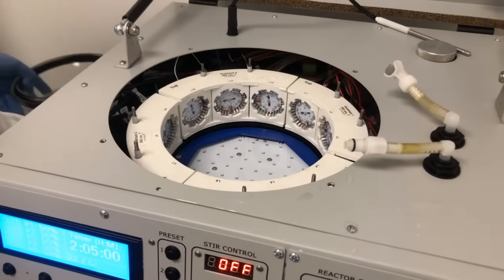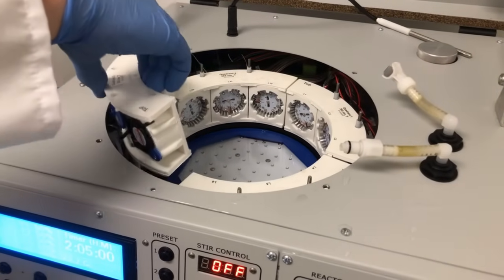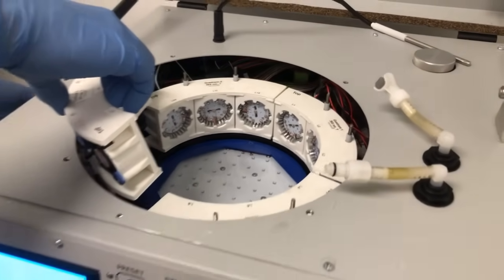With the reaction chamber removed, you have direct access to each of the light modules, which can be swapped out to accommodate different wavelengths.